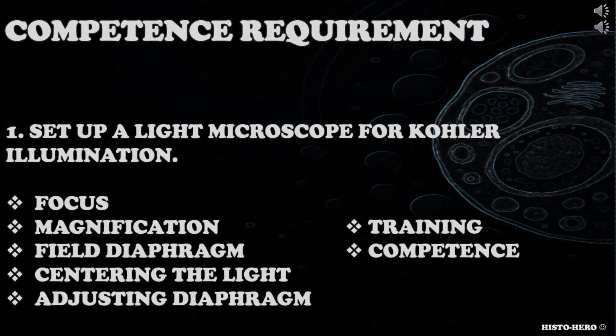Let's explore the first competence requirement, which is for you to set up a light microscope for Köhler illumination. What is Köhler illumination? How would you set up a light microscope for Köhler illumination? Consider the key steps like focus, magnification, field diaphragm, centering, your training and competence.